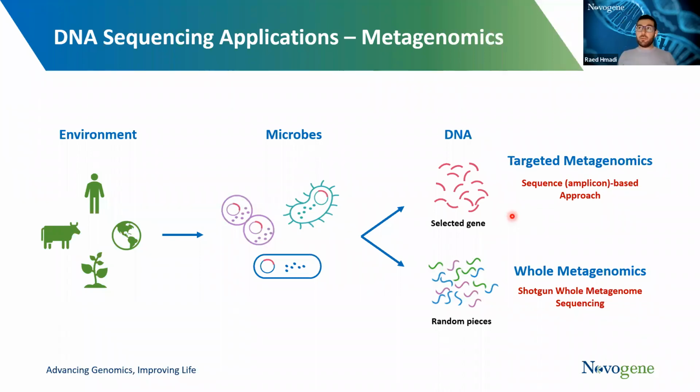So if I understood the question correctly, then they have a limited amount of DNA, and one way of increasing the amount of DNA that you have is by performing PCR. That would exponentially amplify the amount of DNA that you have.